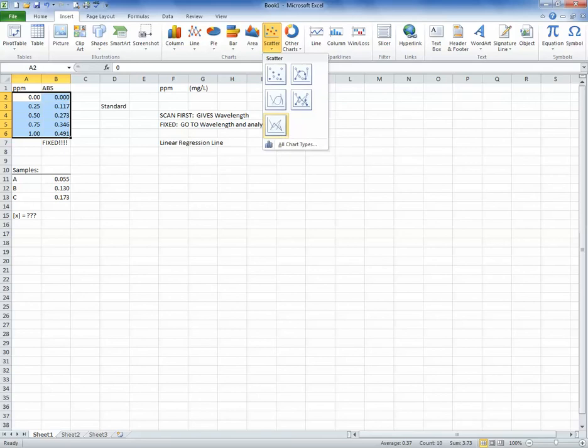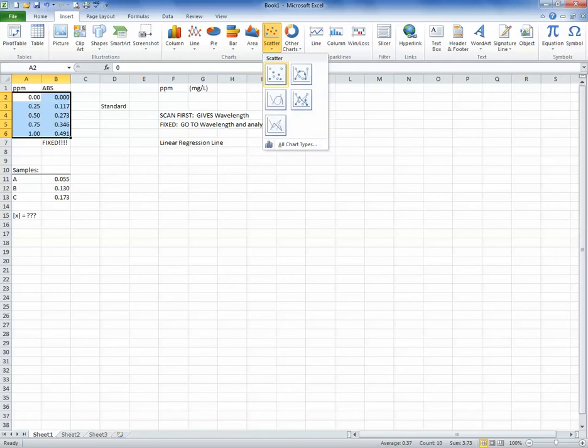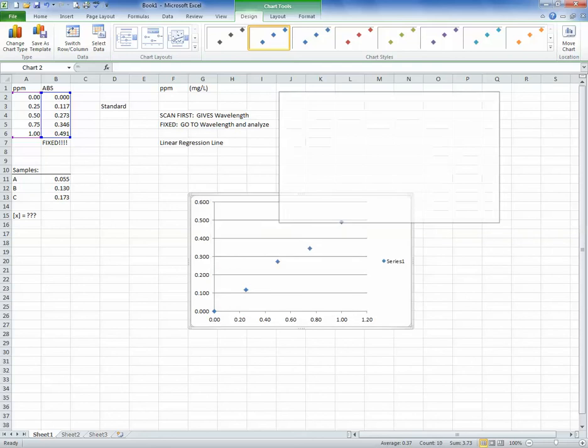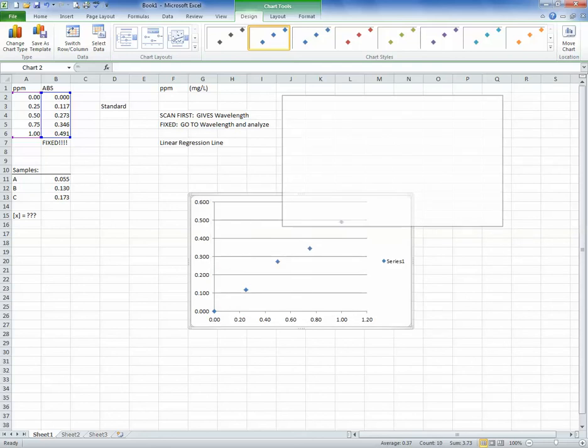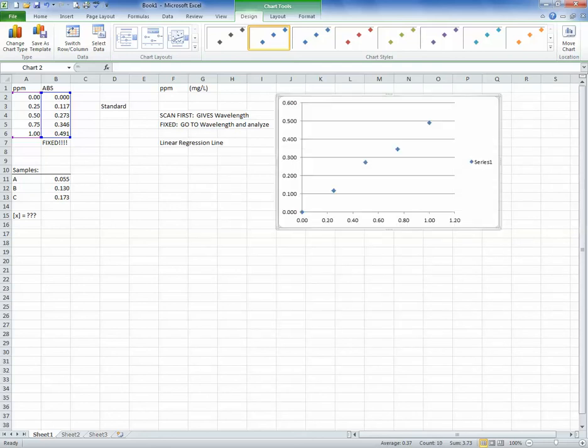I can plot the points only. I can plot the points with a curvy line through all of them. I can plot no points, just the curvy line only. I can plot the points with a straight line that goes through each individual or between two points. And then here is the straight line between the points without the points plotted. The only thing that we have to do is plot the markers or our data points. That's it. We don't want any lines, not yet. We just want to plot our data.